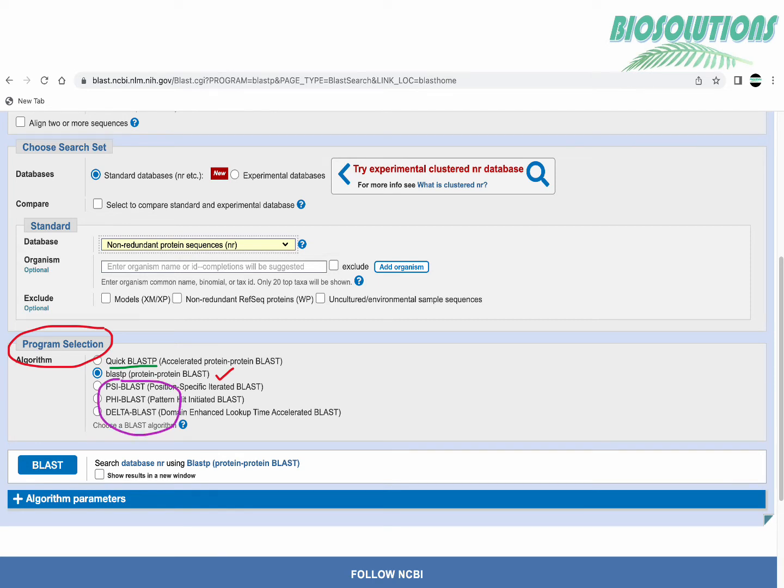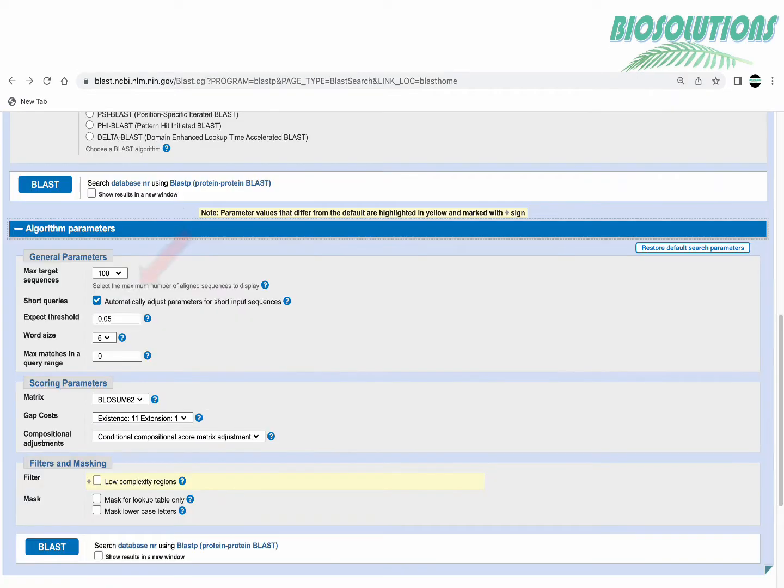The other three BLAST options which are shown here are very specific to match with the pattern or domain etc and we are not going to discuss them here. We will usually not change the additional algorithm parameters as well and leave them as default.